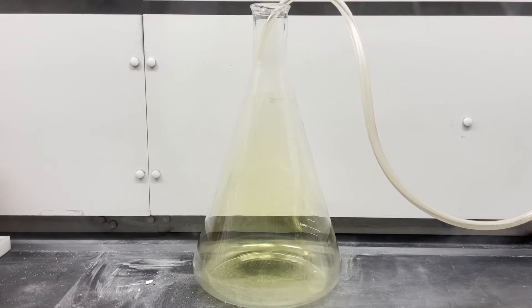To start, I fill this 6-liter flask with chlorine gas. It's heavier than air, so it doesn't dissipate. You can see its yellowish color there in the flask.